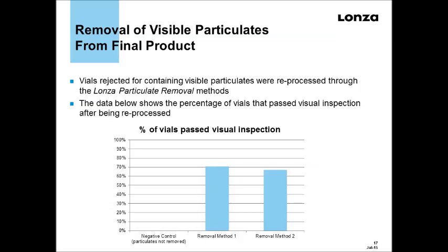Now we're looking at different ways to do filtration of stem cells and other cells that are in group. Think about it. I can't push them through fast because shear will kill these cells. They're relatively large, so you can't push them through a micron filter. You can't push them through anything. So we had to develop techniques for high volume, low shear processing to decrease the number of particles that enter into the system. With this, we can decrease our number of particles down to a much more reasonable level. With that, we have been able to do it without losing viability of the cell. But again, this is required to happen within a very short period when you're doing the actual harvesting.